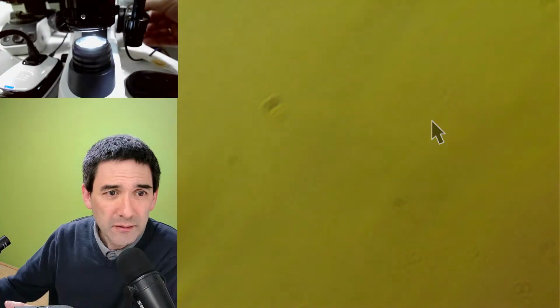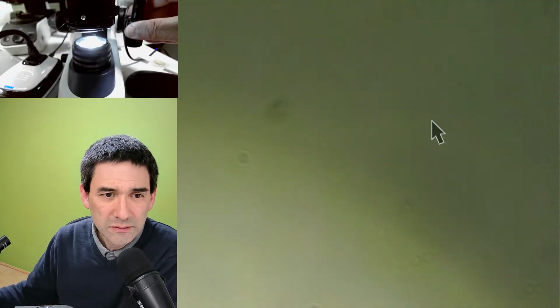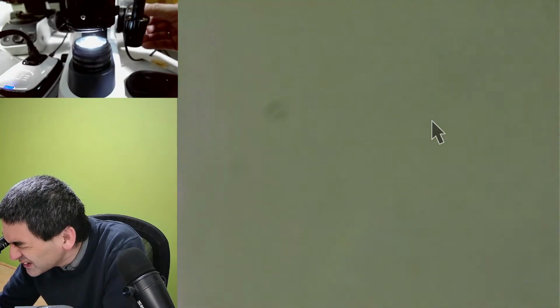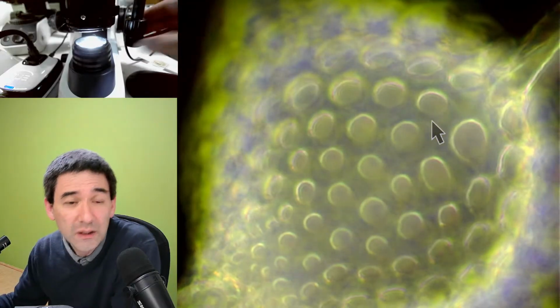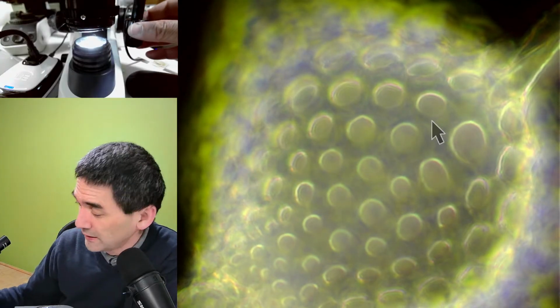it's a little bit. I think I've lost it a little bit. Here we go. Let me see. The background is not completely dark either. Let me check here. Here, this one. It's not in the center. Here we go. So that's now using my 40 times objective, right? And it's still okay.